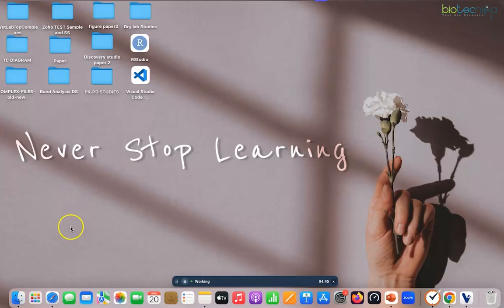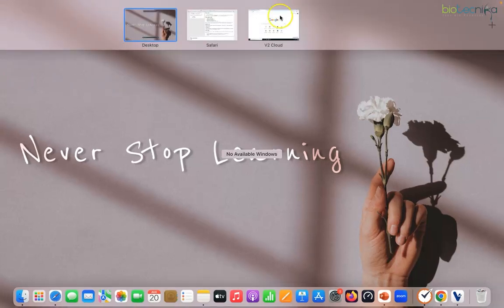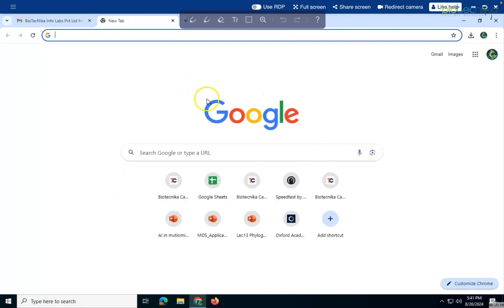Okay, so let's get started. I will be showing you the demonstration via two systems. One is your Windows as well as your Mac. Let's first get into the Windows system. So as you can see, this is the Windows system.